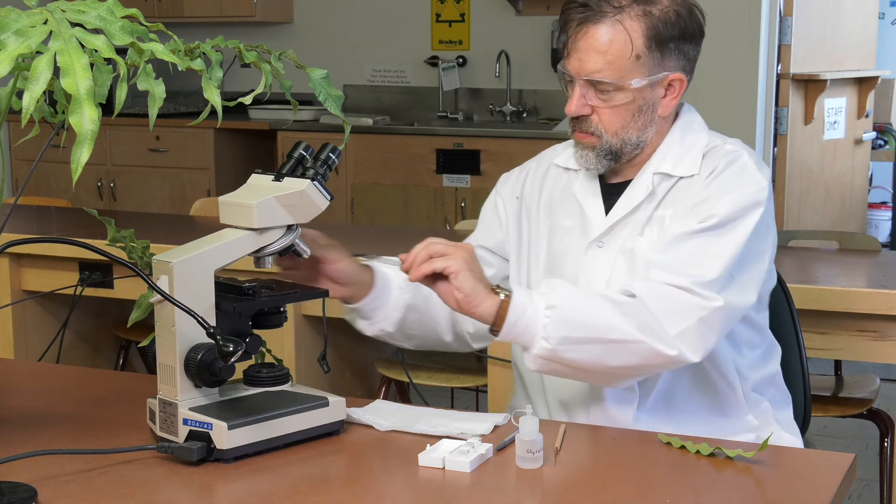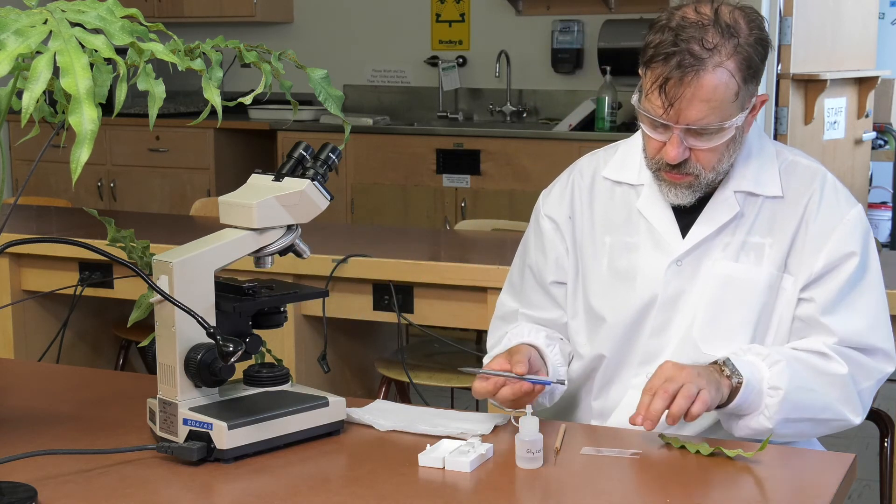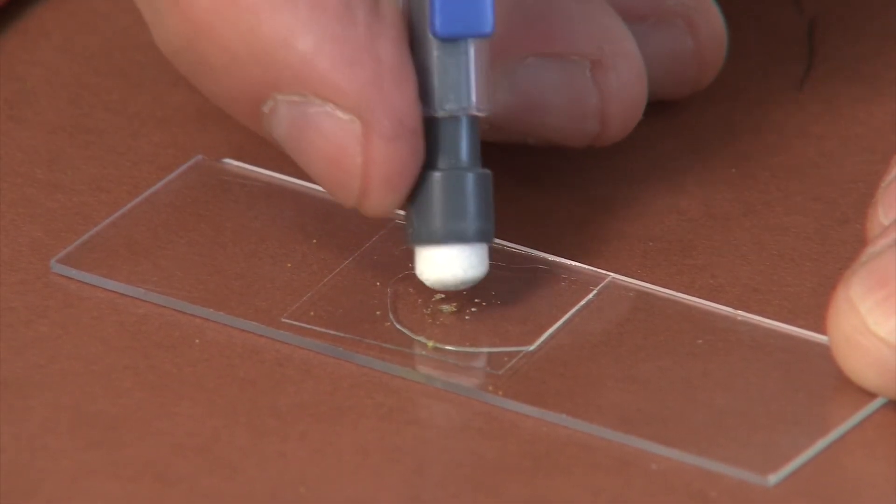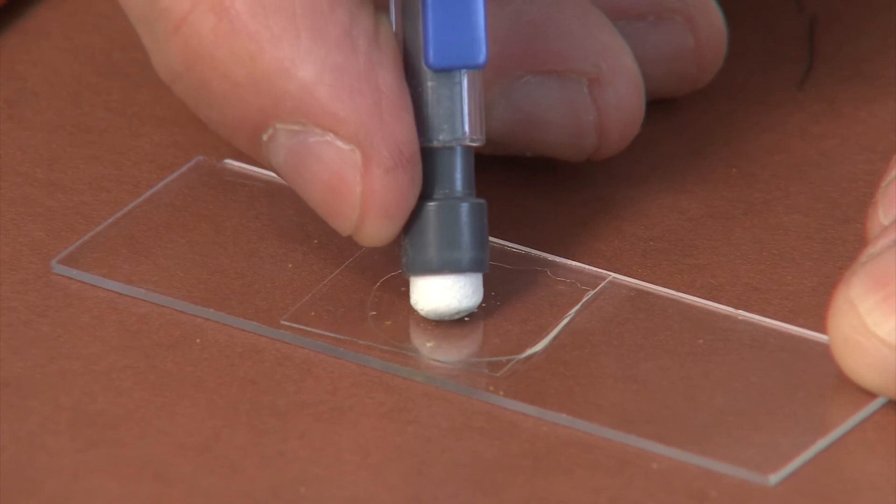Remove the slide from the microscope. Using the eraser end of your pencil, gently apply slight pressure to the cover slip. This will burst the sporangia.